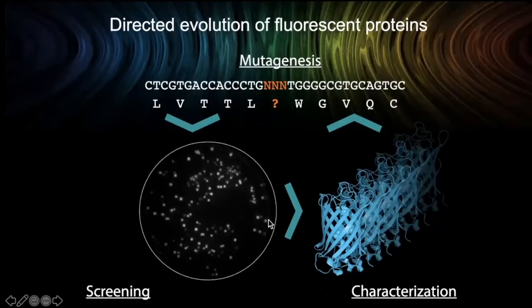And typically in optimizing fluorescent proteins, our lab has contributed mainly to two of them specifically, which I would like to cover in the next few minutes, is that you start to fiddle around with the DNA. So you can introduce certain changes and create libraries, for instance, mutated completely around one amino acid position. So you can order DNA with degenerate codon usage. And then you can transform bacteria and plate them out on petri dishes. And then here you see individual colonies, and each colony expresses a unique variant with a specific amino acid at this position or other changes. And in principle, you start to screen: do we think it is bright or photostable, et cetera.